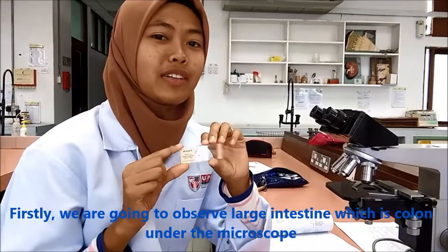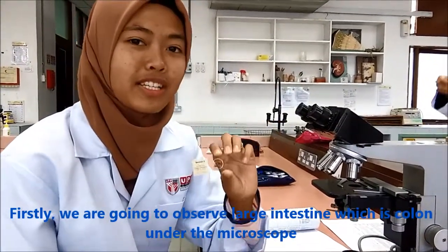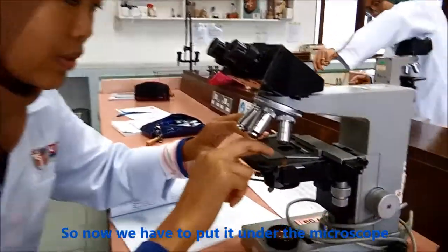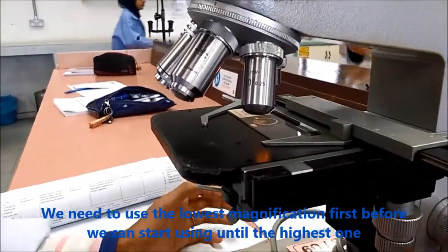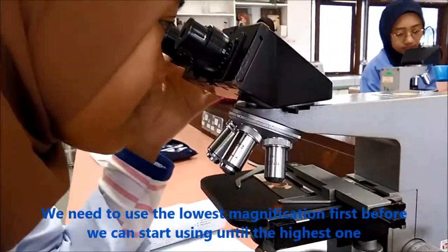Okay, so firstly, we are going to observe the large intestine under the microscope. So now, we have to put it in the microscope. We need to use the lowest magnification first before we can start using until the highest one.